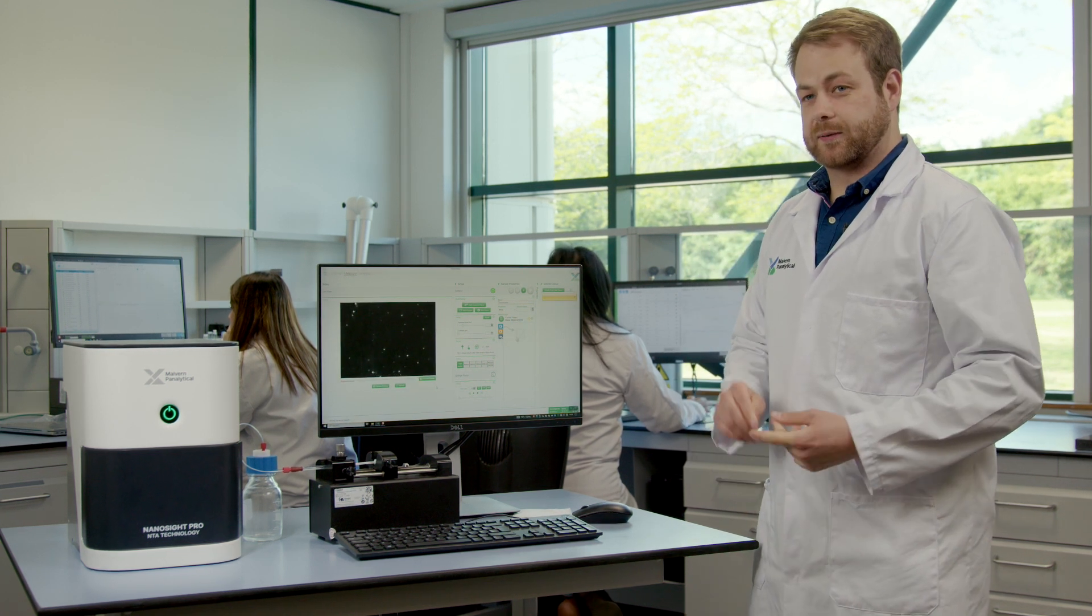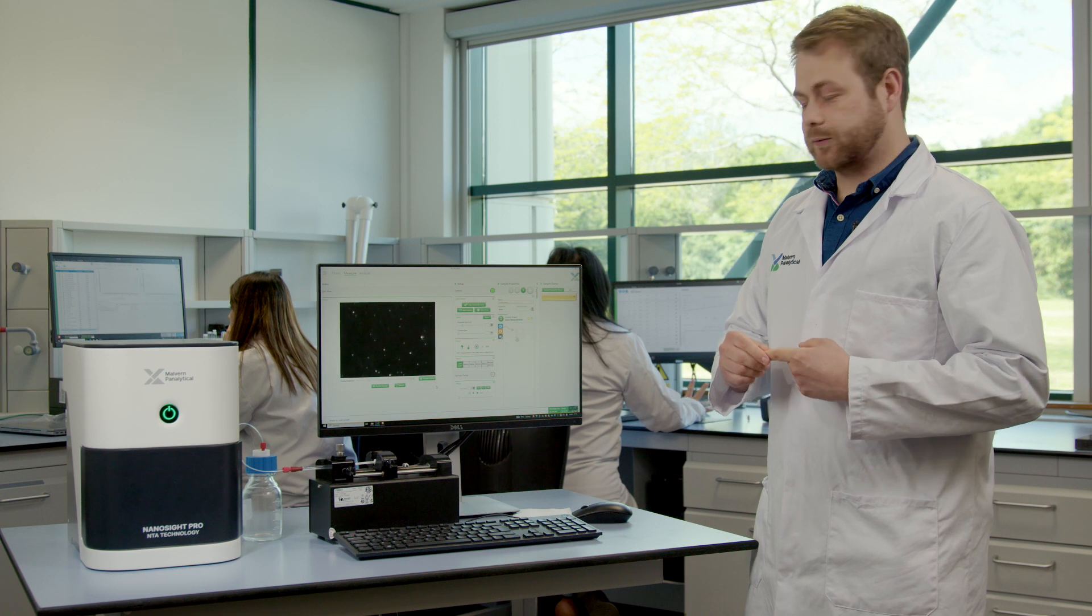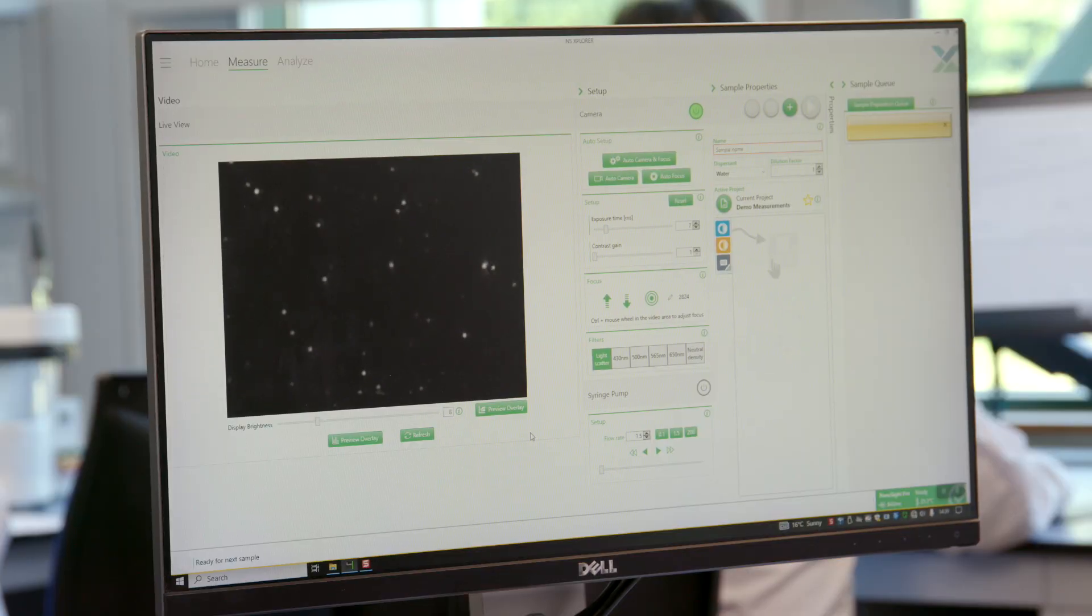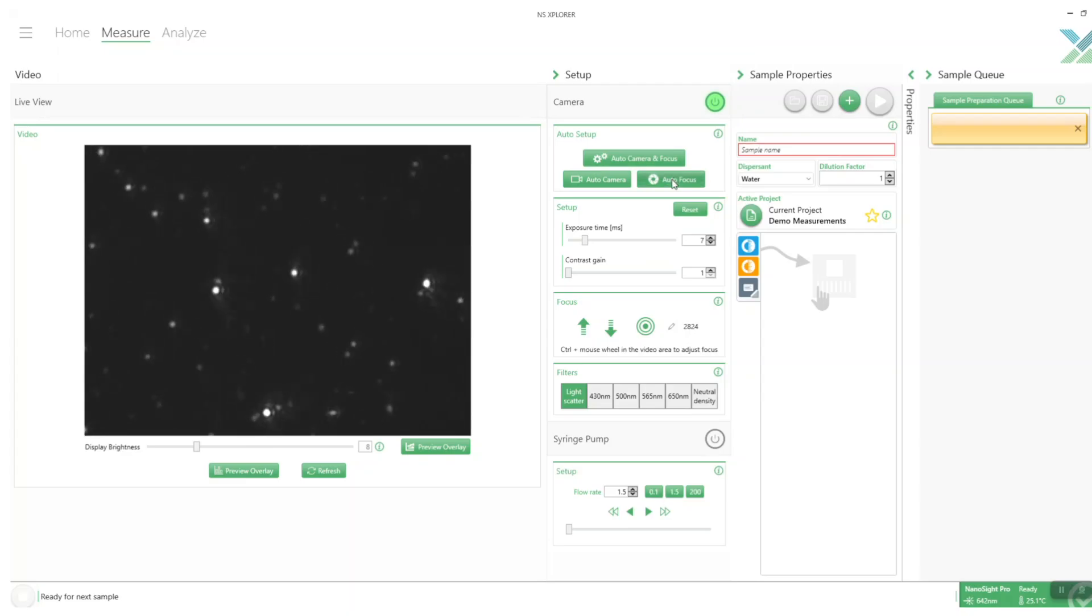You can do it one of two ways. You can either do it using manual setup or you can do auto setup which is much easier. We're going to start off here by using the autofocus. I just click on this and then the software will look for the best focus for this sample.